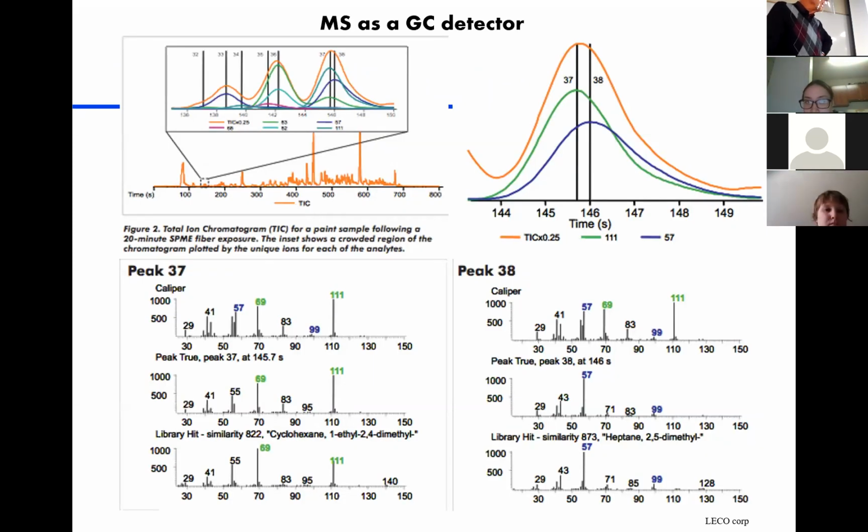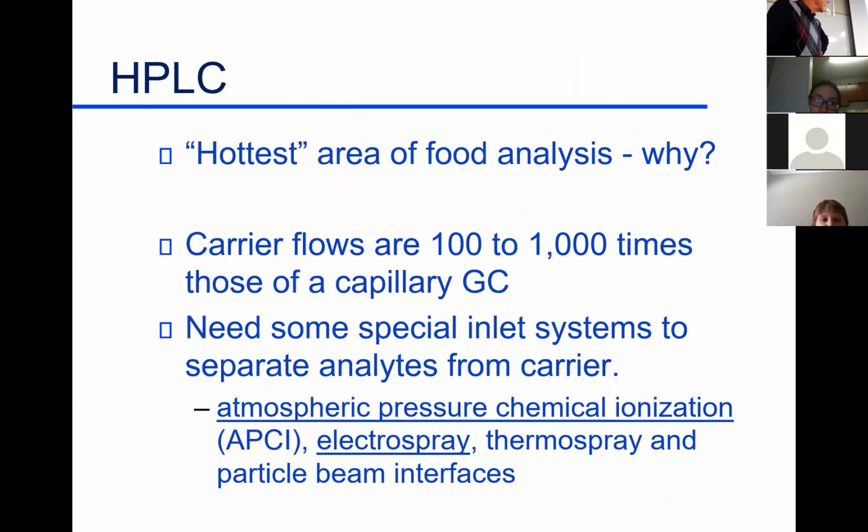Now, I didn't go over this figure? Yeah, that's what I thought. Okay, so let's, how about this one? I think we started a little bit earlier maybe than we needed to. So anyway, you got a double dose perhaps of gas chromatography mass spectrometry.